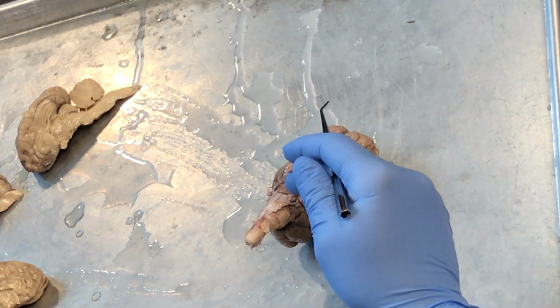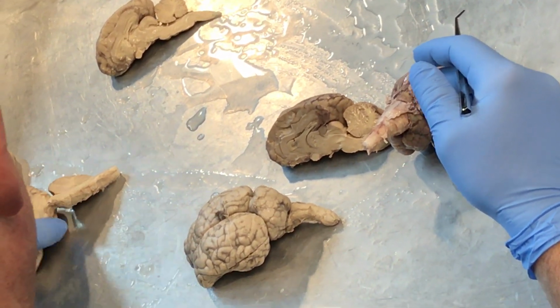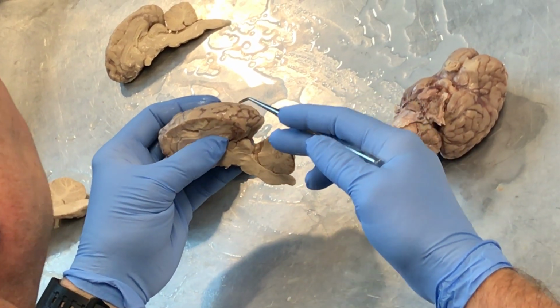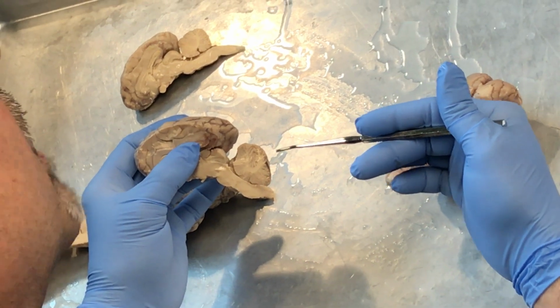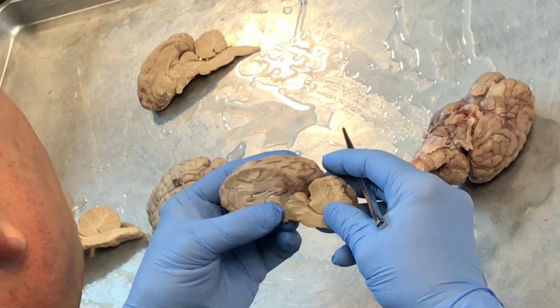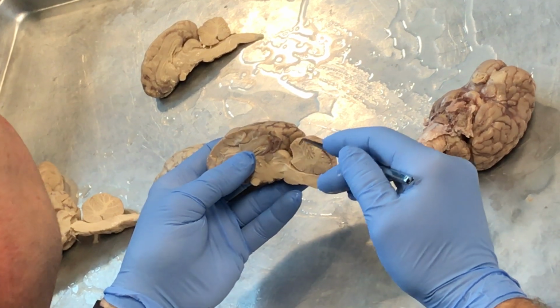Next layer is the arachnoid layer. Now the arachnoid layer is found in all of these brains. The reason I know that is if you can see any blood vessels at all, and you can't see down into these little divots here, then you know it's still attached. The arachnoid layer is named after the word arachnoid, which comes from what? Spider, right? You saw Arachnophobia with Jeff Daniels. That's your homework tonight. Come back with a movie line. So if you see vessels on the surface, you know it still has the arachnoid layer attached.